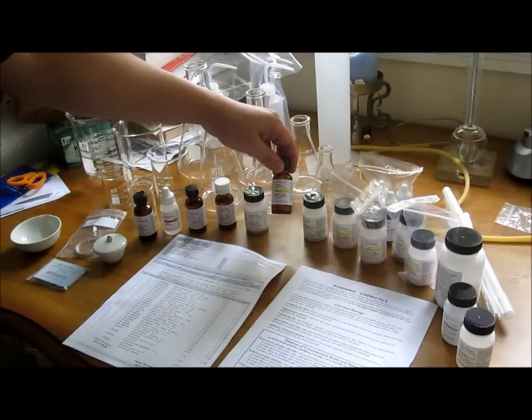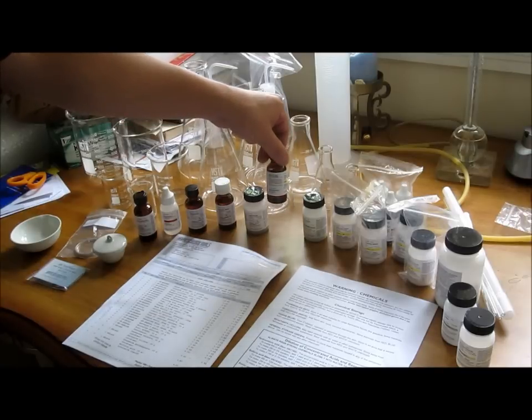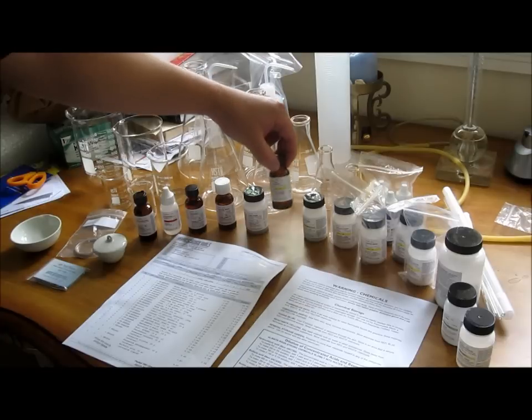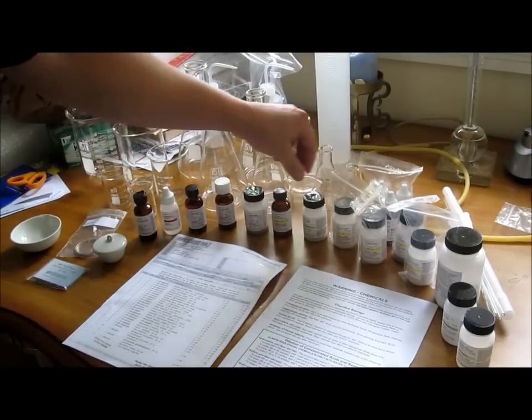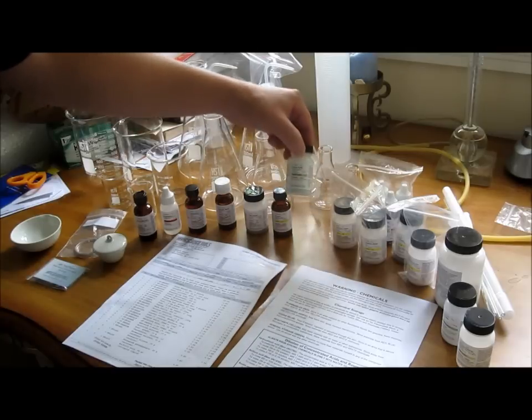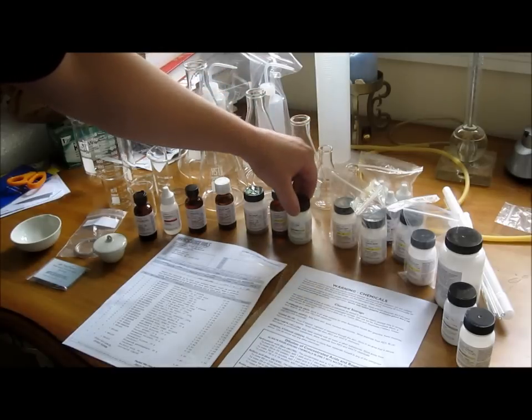Also 30% hydrogen peroxide. This stuff is kind of nasty so it's nice that you can get it in a small 30 ml quantity. You can be using this for Fenton's reagent which is an iron based catalyst. Also using ferrous sulfate for the Fenton's reagent.